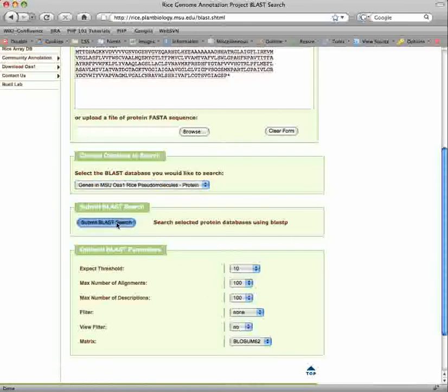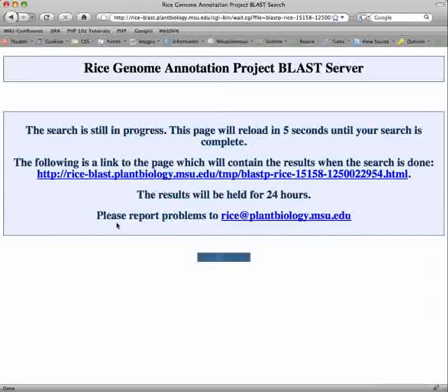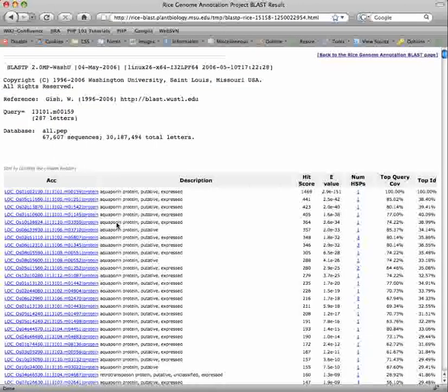When you select Submit, a temporary page will appear until your search is completed. On the BLAST report page, you will see the accession, putative description, and alignment statistics.